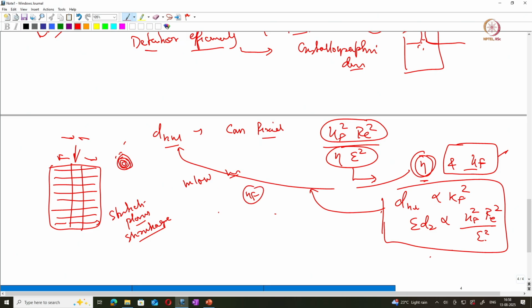This variation in the lateral dimension of the area accompanies the variation in the measured angle between the crystallographic axes. So this is your x and z. If you look perpendicular to the reconstruction, you will have certain poles at different locations of the detector, correct?